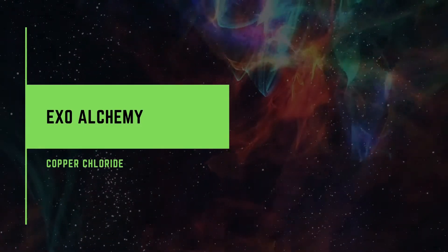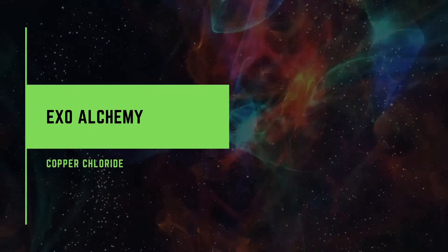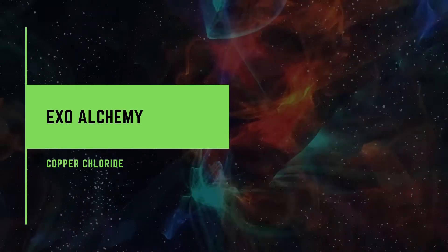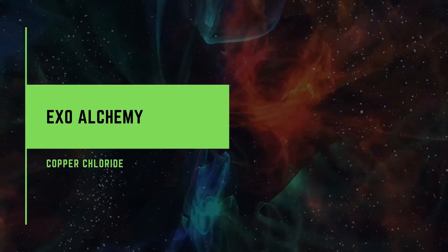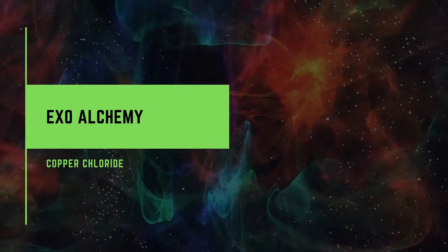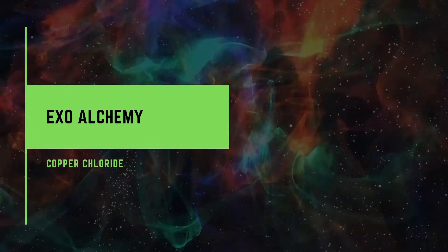Hello fellow alchemists. Today I will be creating copper chloride. This compound is a beautiful green color. It is also a useful oxidizer and chlorinating agent.